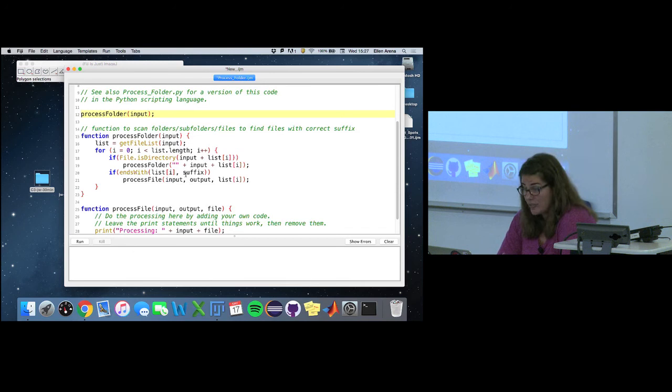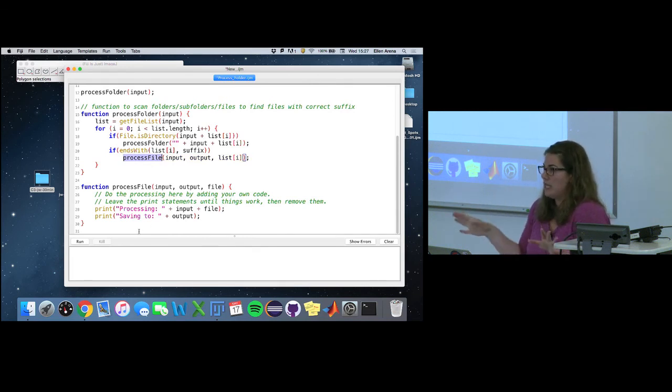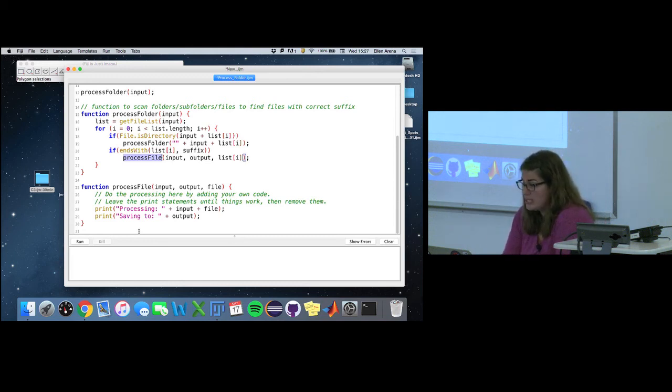And that's a function that will have all of your macro code in it, your script. In our case, we're going to segment and count and measure those nuclei, just as we did before when we built that script in the beginning. So this is where you would just copy and paste that code. As long as it's a TIFF image, we want to process it.